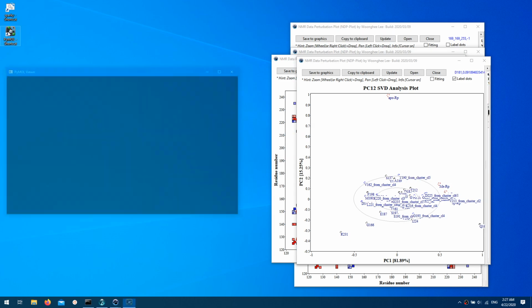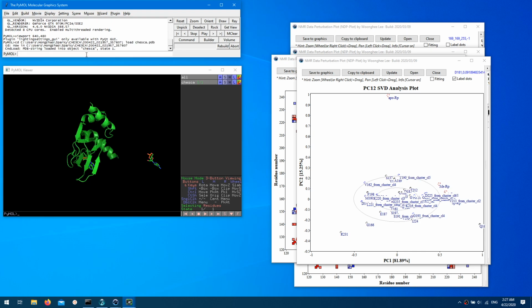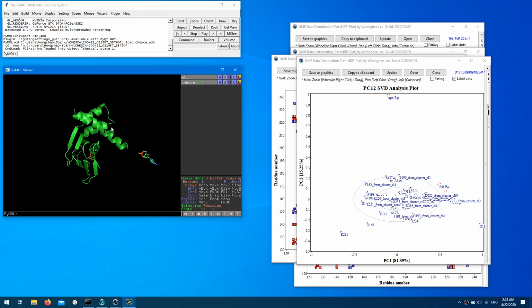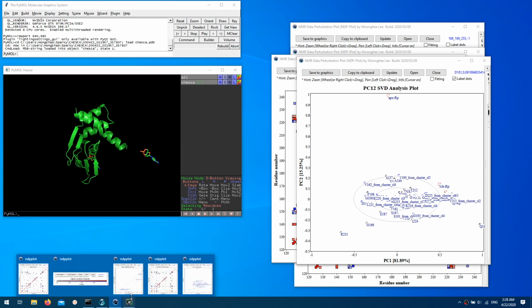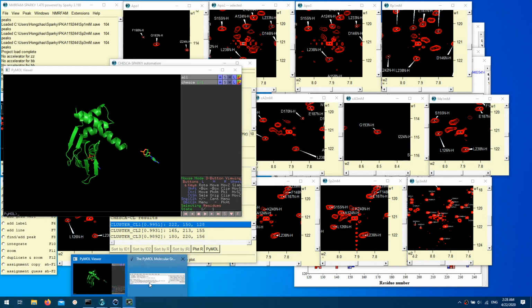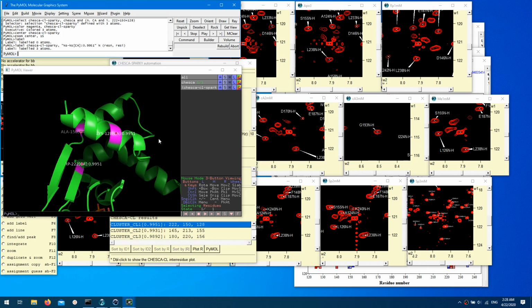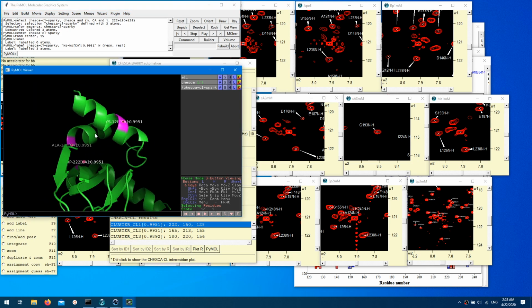Start PyMOL manually, and paste the command. Then a structure is generated and loaded in your PyMOL. So here you should select the cluster of your interest and type @p in your command line. Here you should see the cluster plotted on your structure.